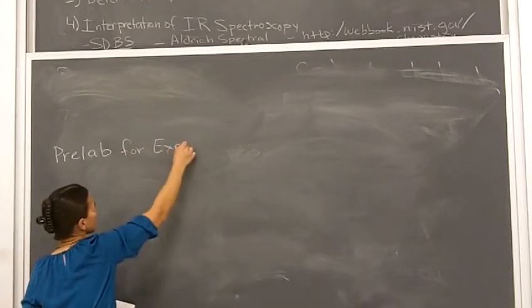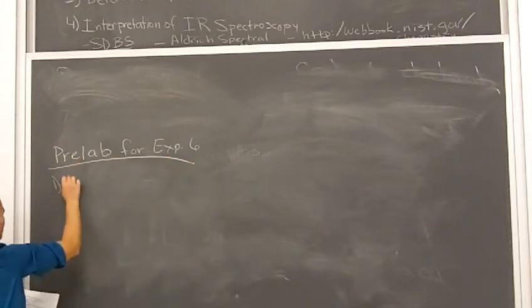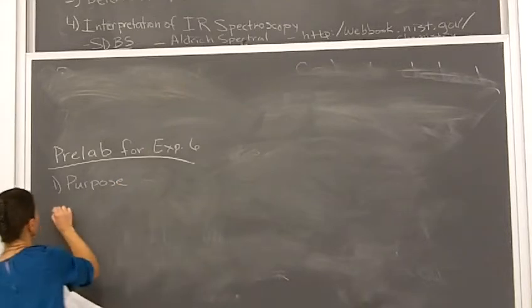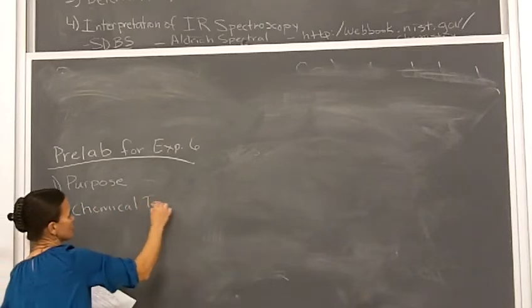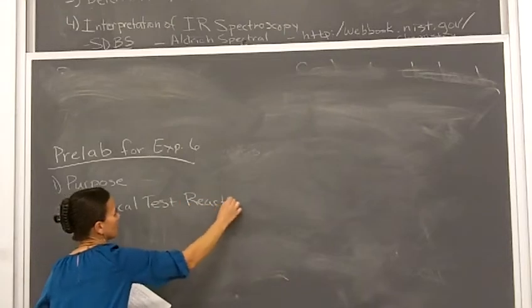So for prelab, your prelab is for experiment 6, okay? So first of all, you need your purpose. You'll need the chemical test reactions. So we just went through all those, and they are in your lab manual.